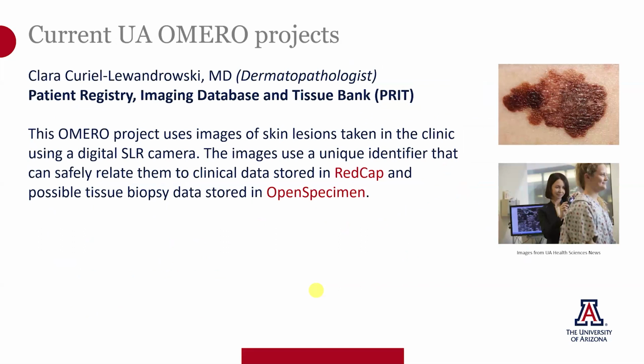We have a couple of projects going, and we're looking for more. Dr. Curiel, the Cancer Center, is working on a collection of images taken in the clinic of skin lesions, and they use just a regular digital SLR camera. They have clinical data that they've acquired in REDCap, and if there's a biopsy done, that information goes into OpenSpecimen. All that's connected through a unique identifier.